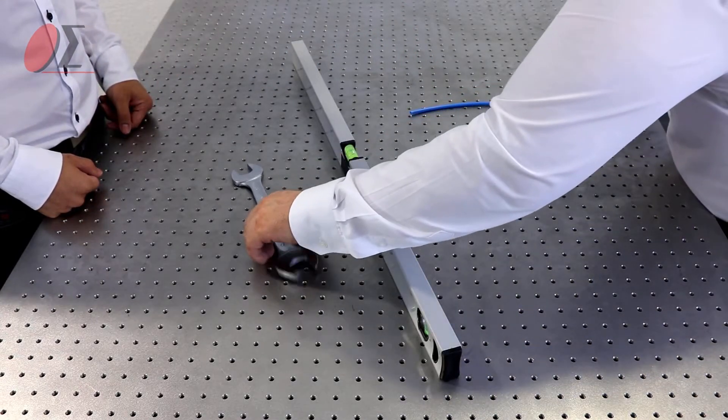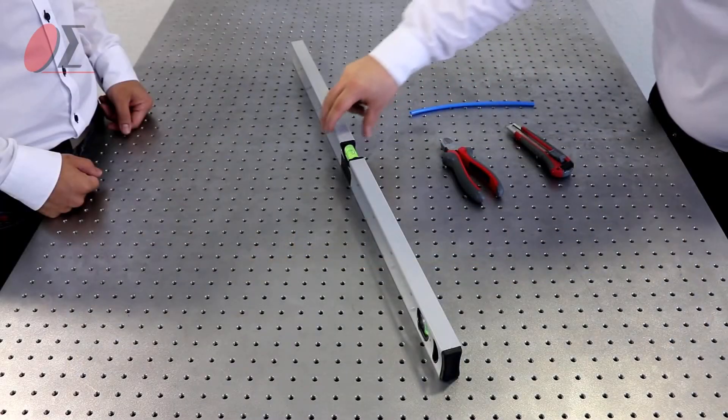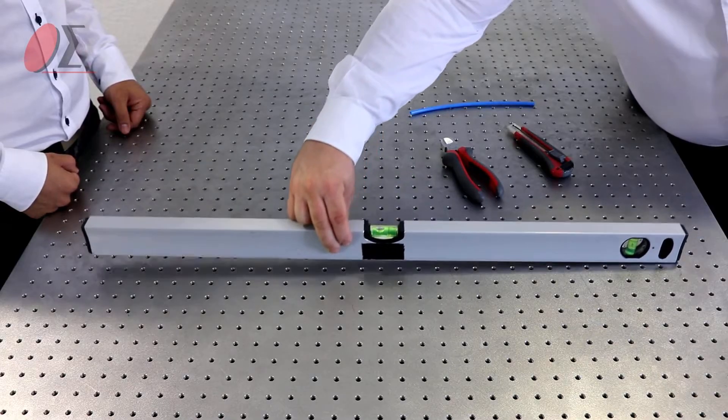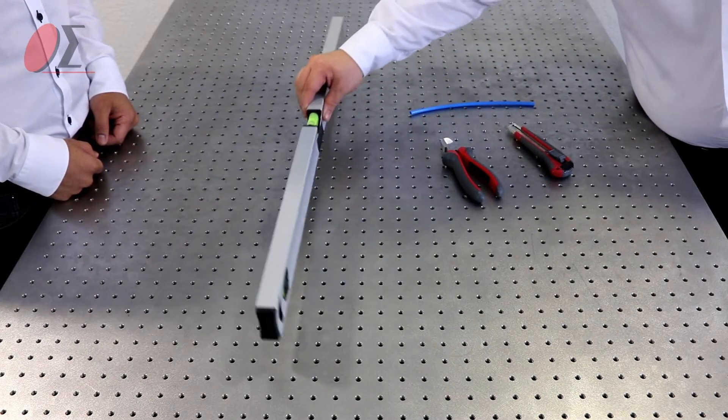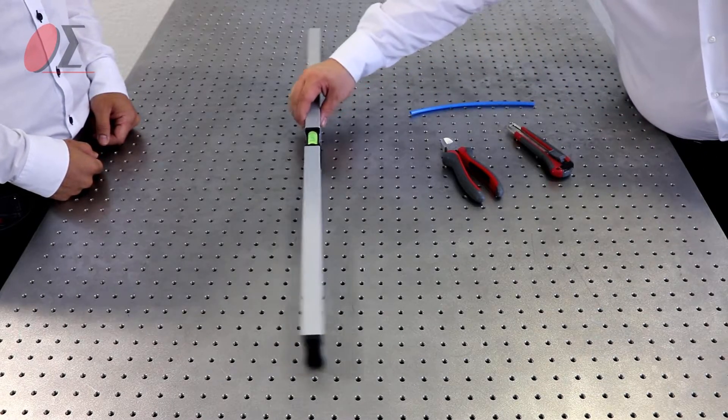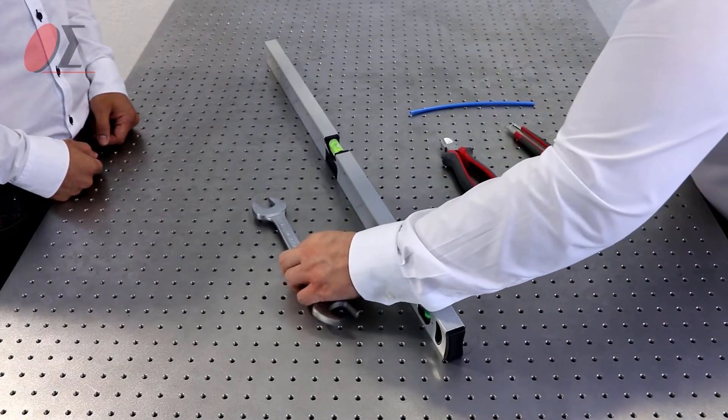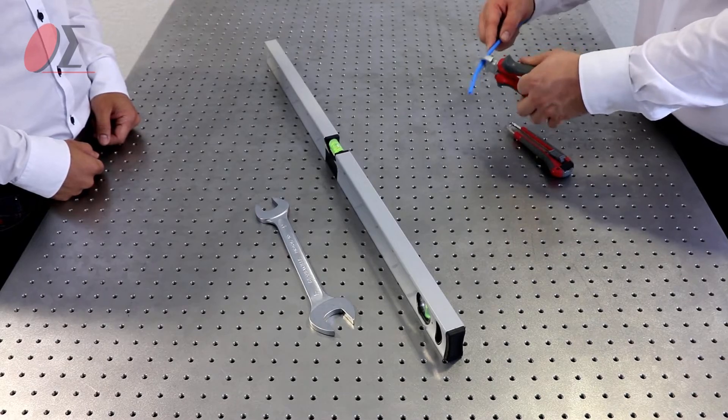We're using the wrench to adjust the isolator. You're checking this with the level, so make sure you check this in X and you check this in Y direction. Make sure the optic table is well leveled. Here's the cutter and with this we can easily shorten the air pipe.